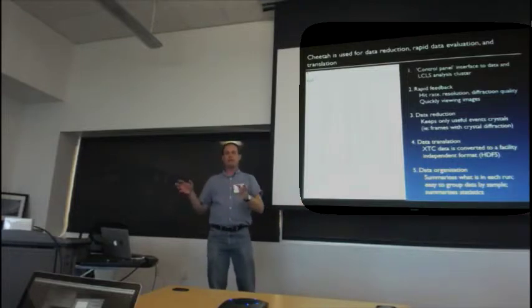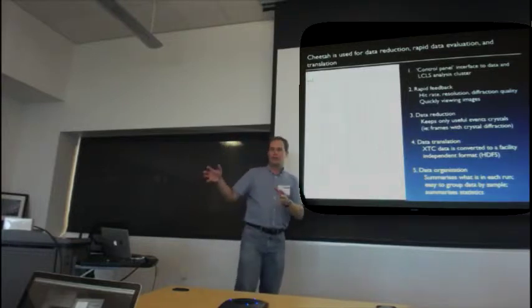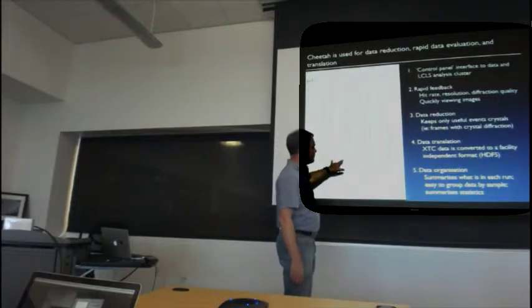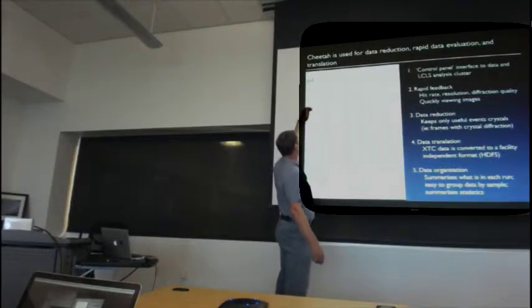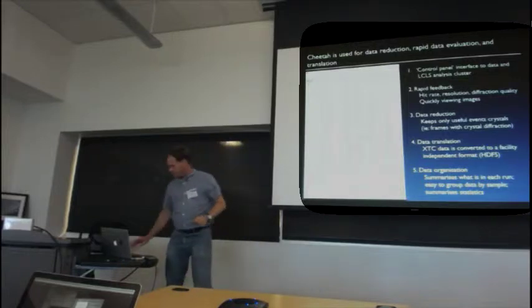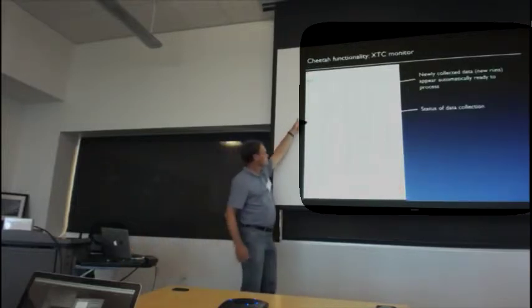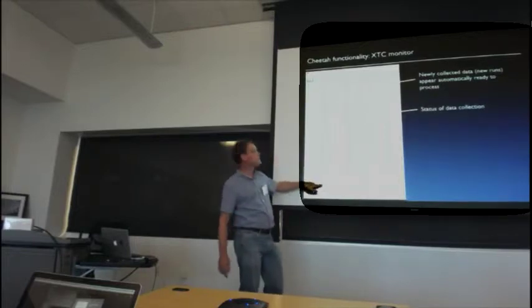If you want to analyse your data at home or somewhere else, you do not have to translate or port an XTC reader. You just need a HDF5 reader. All of that mess is dealt with by Cheetah, and it provides a top-level organisation. So if you process everything with the same conditions, with the same ini file, it'll tag it for you, and everything will be sorted out. Newly collected runs: as you collect new data, it appears here, and it comes up that it's ready for analysis.